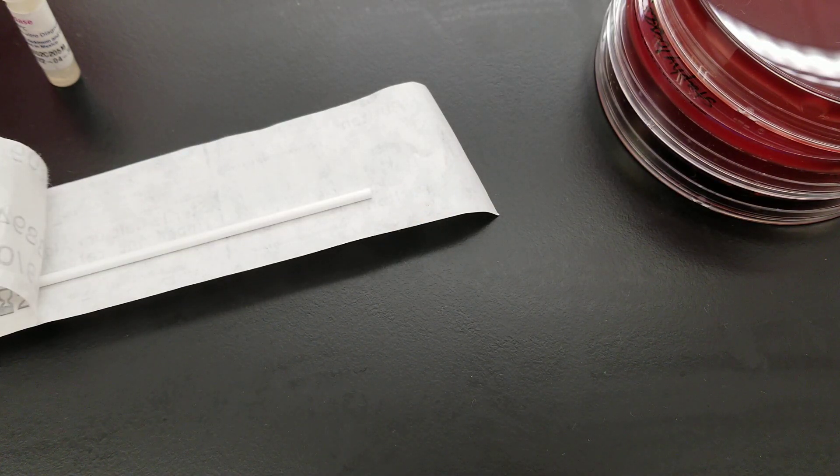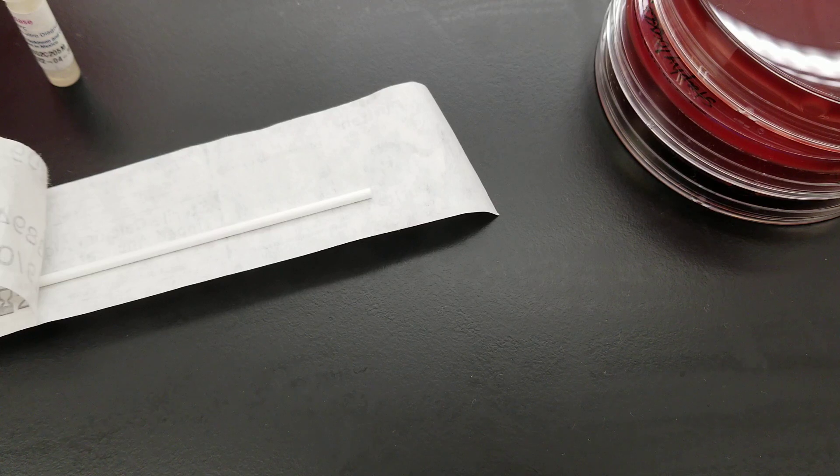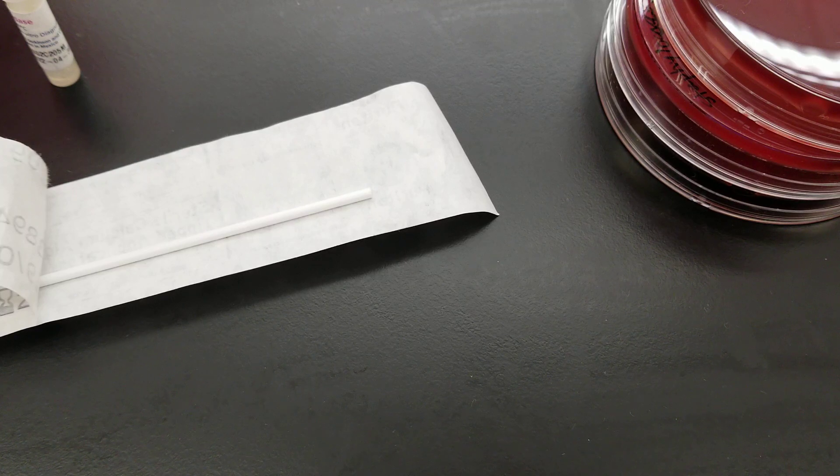Our first grouping of organisms in our course include the gram-positive cocci, gram-negative cocci, and gram-negative cocobacilli. Out of those, the gram-positive cocci are all negative except micrococcus luteus. Our gram-negative cocci are Neisseria and Moraxella caturalis, and our gram-negative cocobacilli are Haemophilus.